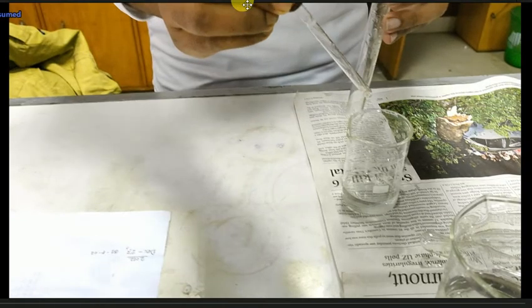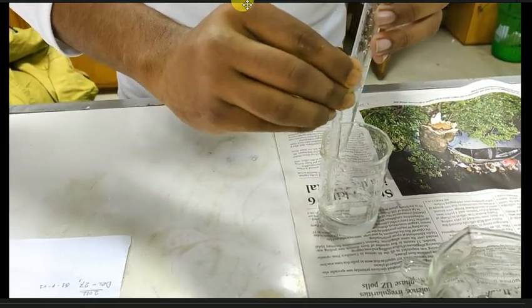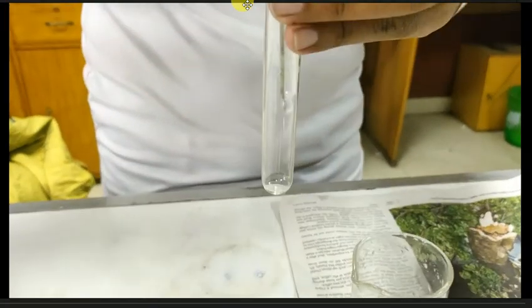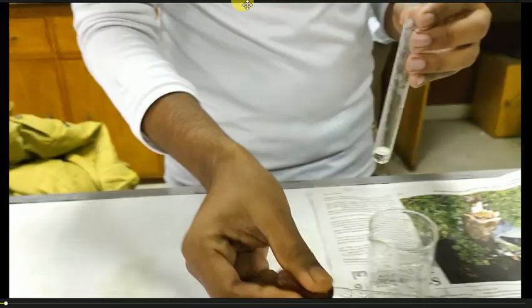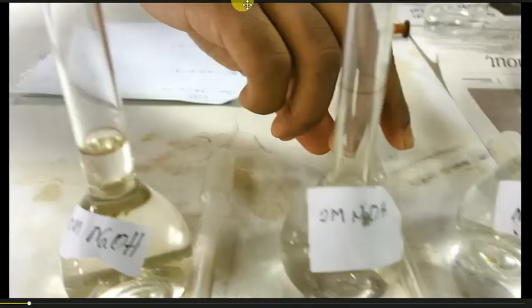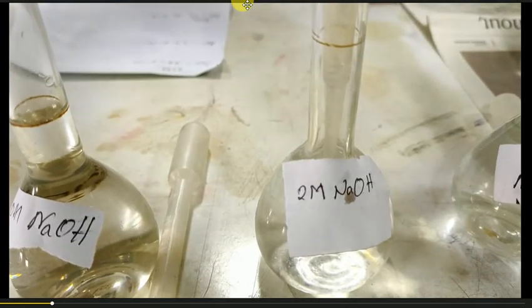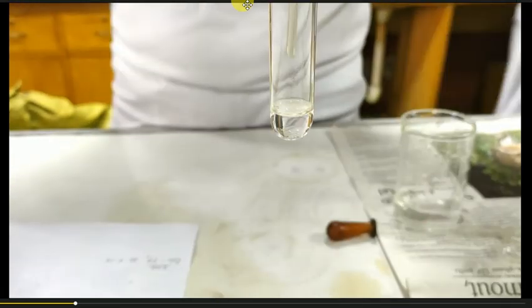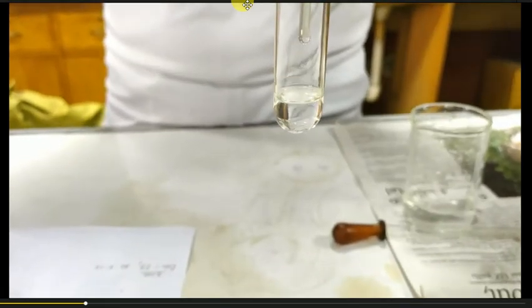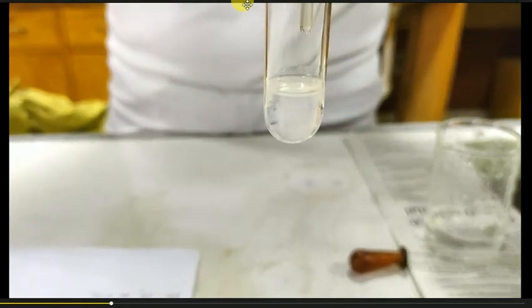Now let us take a look at how the presence of aluminum is confirmed in the laboratory. Take 1 ml sample solution in a test tube. This is the test for aluminum. Now in this sample solution we are going to add dilute sodium hydroxide. This will produce white precipitate, and the precipitate will be soluble in excess alkali.